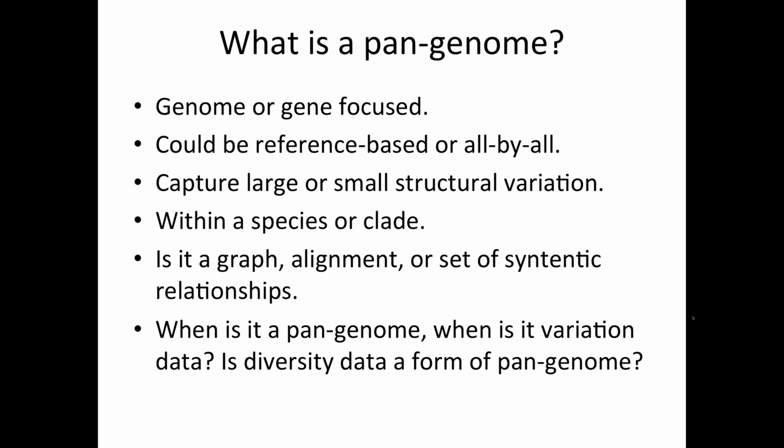Any opinions? I haven't really dealt with pangenome data, but I would think it's more of a gene set from the genome assembly of various cultivars or various lines. A reference genome can have a certain set of genes, but other genomes from other variants will have more genes, less genes.